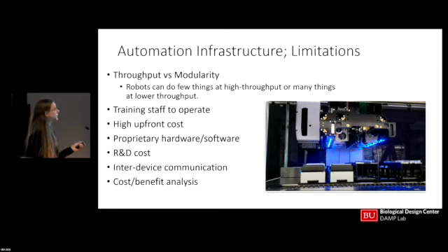In the clinical testing case, it was absolutely a need, but in future workflows, it may be a need or more of a desire to do so you don't have to do it manually. But I think it's important to consider your costs too. So for example, in a DNA assembly workflow at the PCR step, if you're going to automate it, you have to add in additional dead volume for your master mix. You may not necessarily have to do that if you run the process manually. So you have to take into consideration, how many samples am I going to be putting into this? How many people are even going to use the service? Does it make sense to do it?